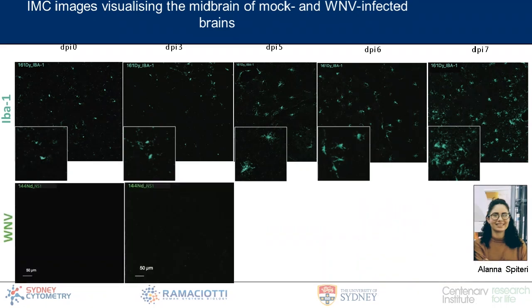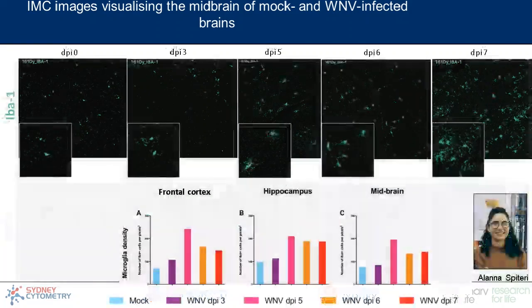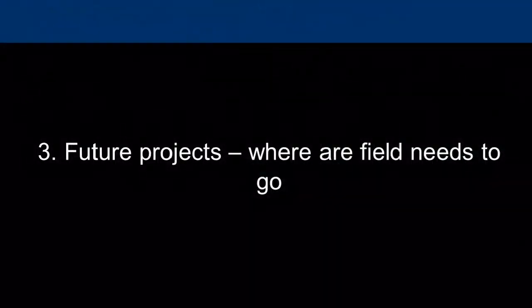Now, this obviously happens in concert with the expansion of viral infection in the brain as this NS1 signal starts to permeate through the neuronal systems in the brain, which becomes substantial over 7 days. And so what we're able to do here is not only visually and phenotypically visualize these changes, but we're able to quantify and track these changes using this segmentation approach, which gives us a very powerful way to merge the suspension approaches that we take in CyTOF with the imaging approaches in IMC.